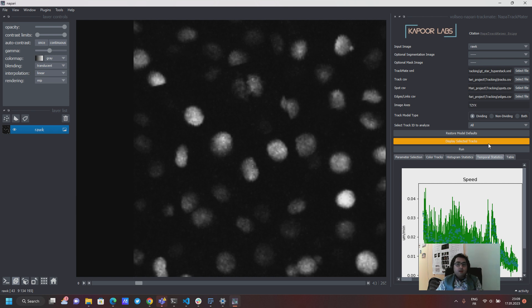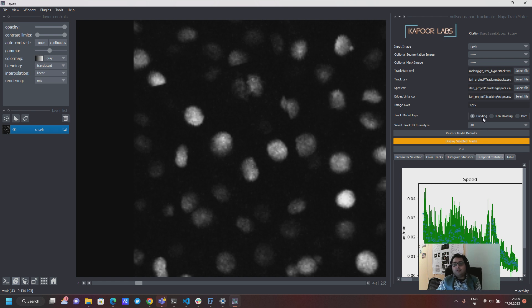And now once you hit the run button you will also see a new dropdown menu appear here which is select the track IDs to analyze and there's a separation between the kind of track type.